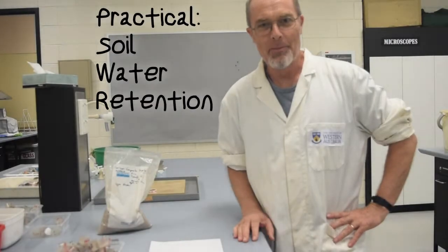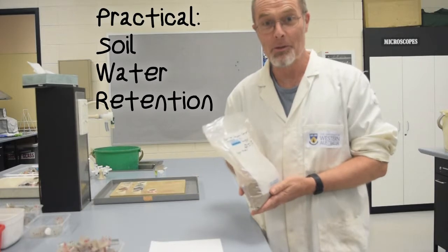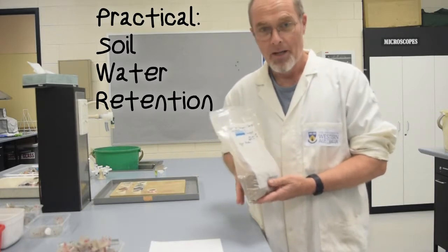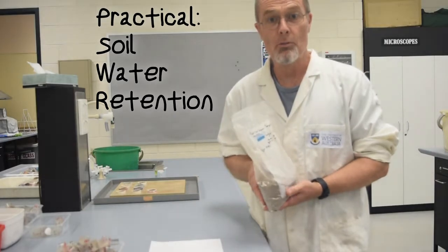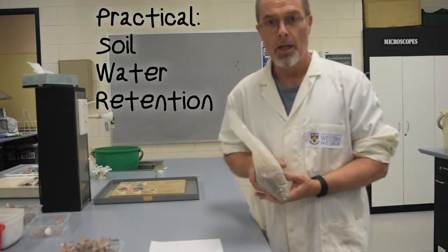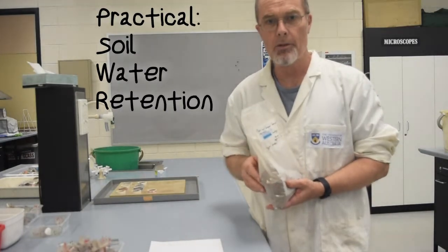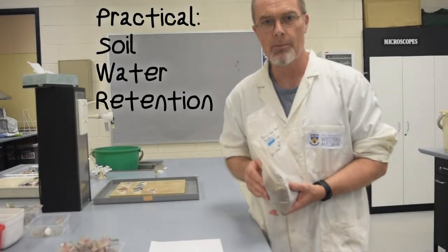Hello everyone. In this week's lab you'll use your horizon composite samples to measure the ability of your soil to retain water. In soil science this is done using what we call the soil water retention curve, which is the relationship of soil water content as it decreases in response to increasing pressure applied to remove the water — at least that's how we do it experimentally.